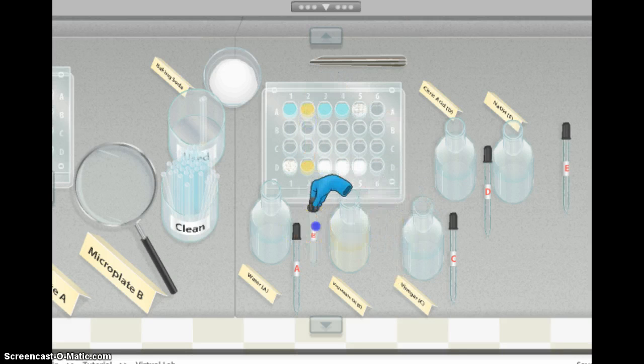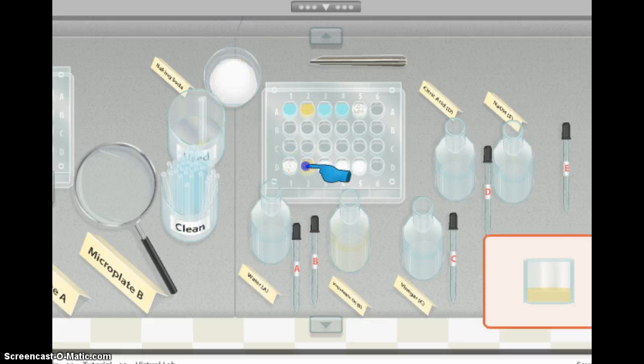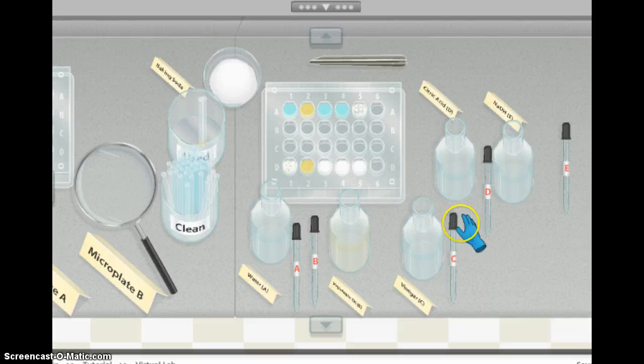And we'll go ahead and add the veggie oil. So for example, if I used this stir stick again, then I would get oil in all my other wells, and that could change my results. All right, so go ahead and write down your observations.